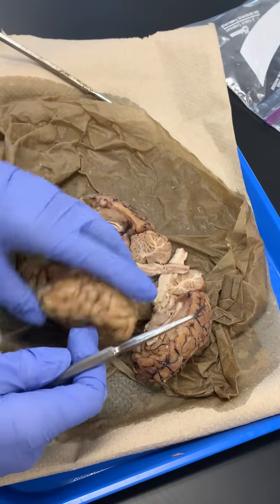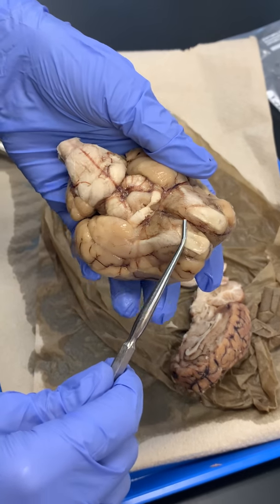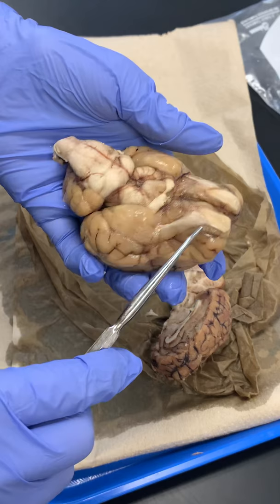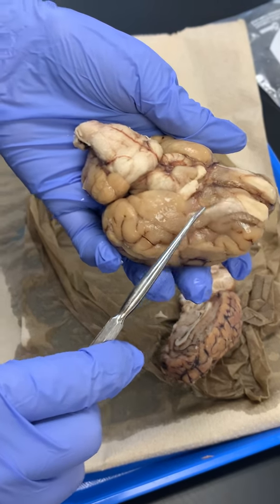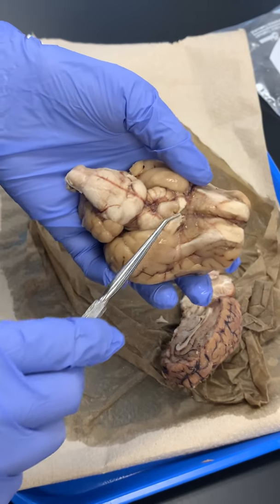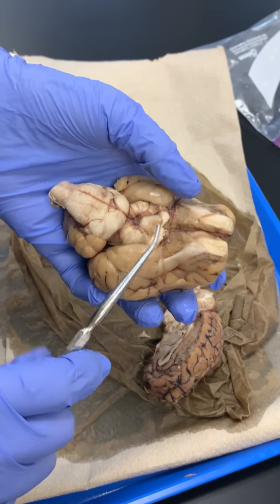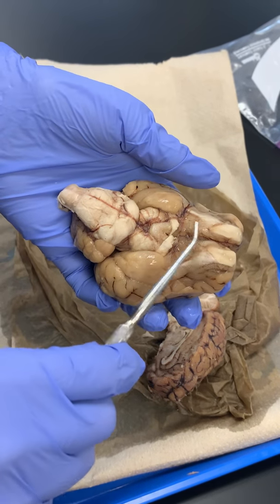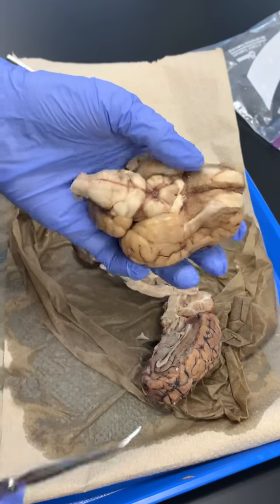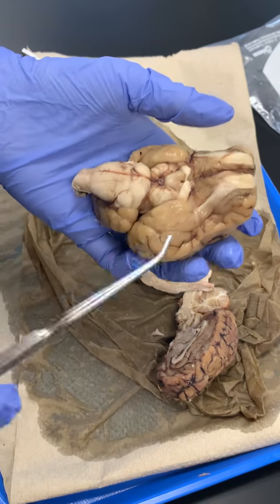The olfactory bulbs are right here, and they receive neural input about odors detected by cells in the nasal cavity. The olfactory tracts are here, and they connect the bulbs to regions of the brain. The optic chiasma is X-shaped right here. It's formed by the crossing of the optic nerves, and the optic nerves, which would come off, they connect the brain to the eyes. The infundibulum is the hole right back here near the optic chiasma.